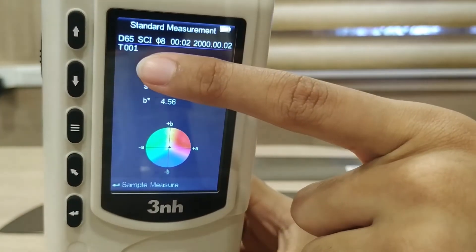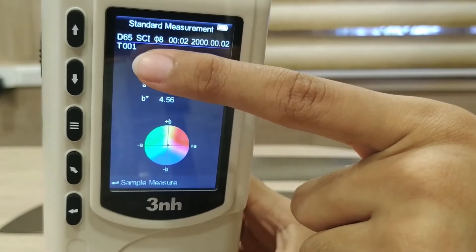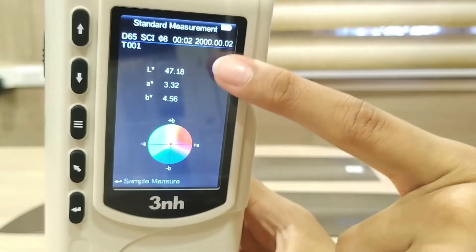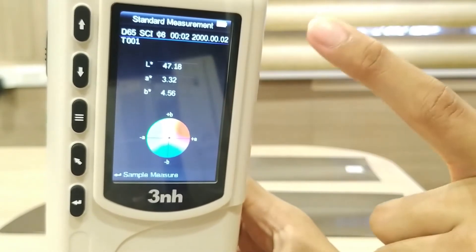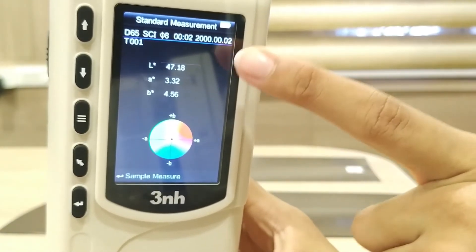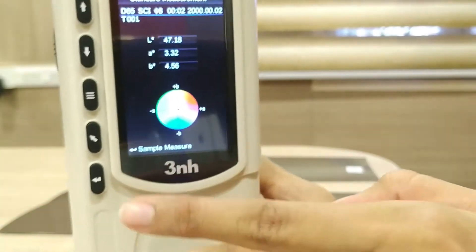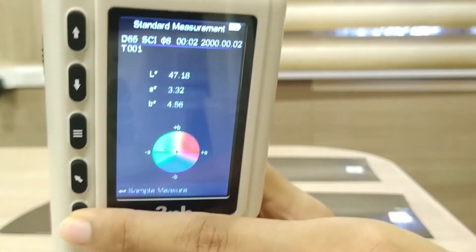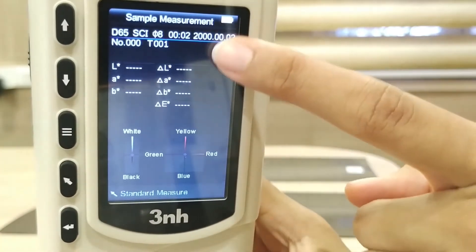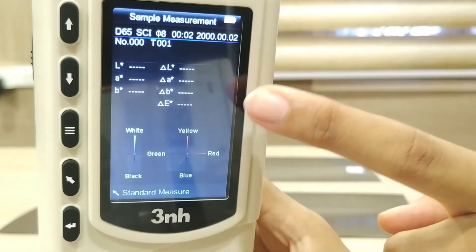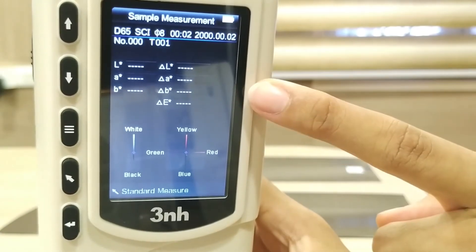Here T001 indicates that this is the first standard. These are the LAB values for our standard. Now to measure the sample based on this standard, you're going to click on this button. As you can see the values are all empty. Here you measure the sample value.